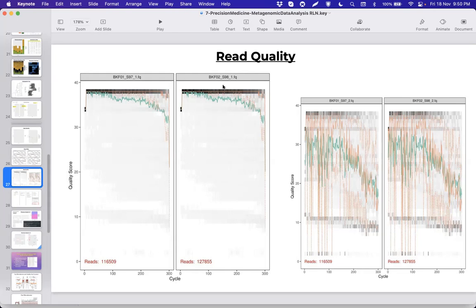So if you see any of the samples with extremely poor quality, you can eliminate that sample and then choose a different sample if you have the luxury of doing that, or you can completely eliminate that sample from the downstream analysis part. So how do you eliminate that sample? That's going to be pretty easy. You can just remove that column. So that's why it's good to start with more samples. And if you find some problematic samples, you can just leave them out. But don't take 50 or 60, finding related information and finding patterns is going to be difficult there also.